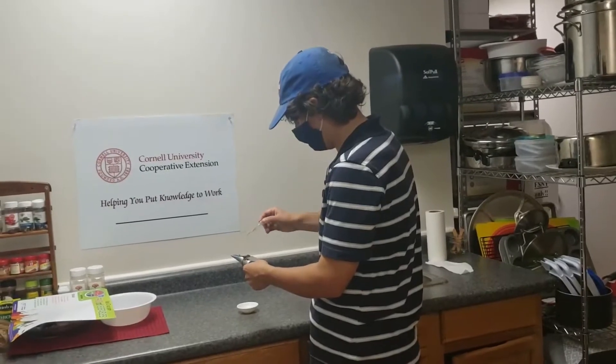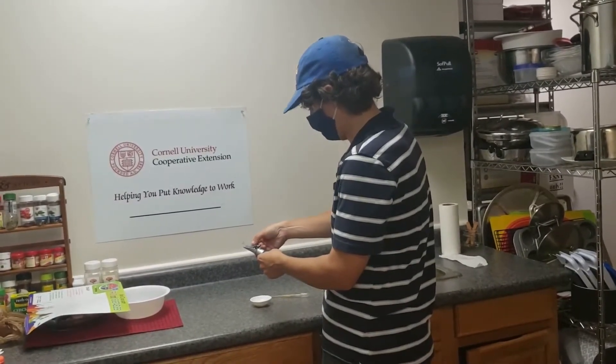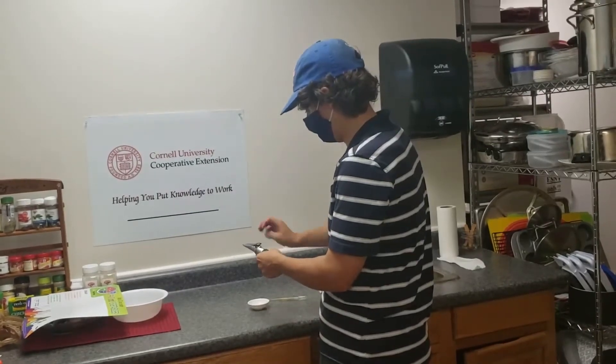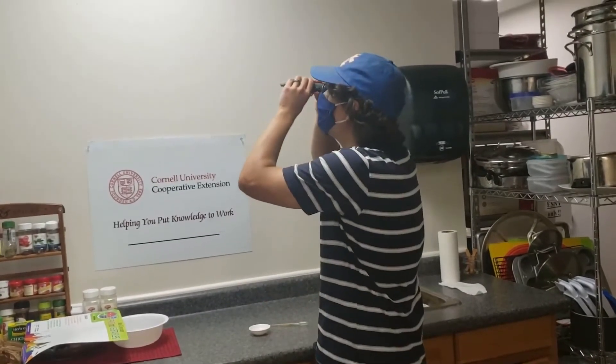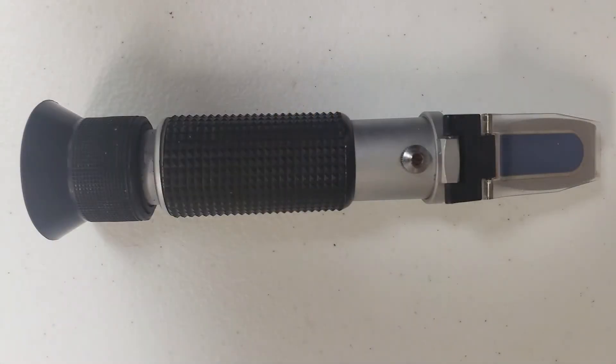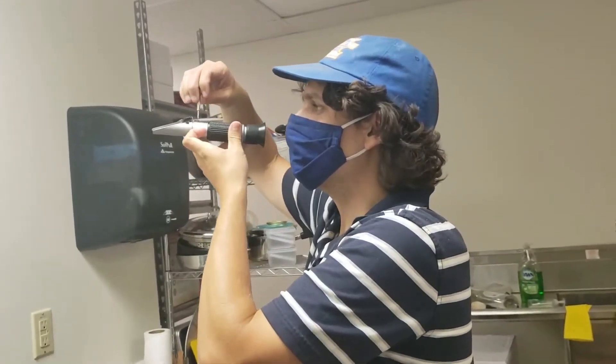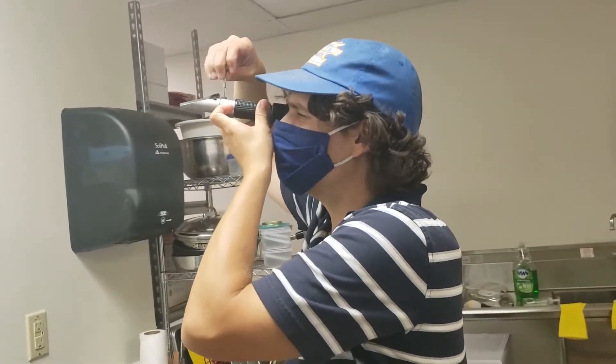The next test we will cover is the Brix measurement, which indicates the percentage of sugars in the fruit. Many varieties also have a recommended minimum Brix as part of their maturity standards. This test is conducted using a refractometer, which can also be purchased online. Before using your refractometer, it should be calibrated following company instructions using purified water.